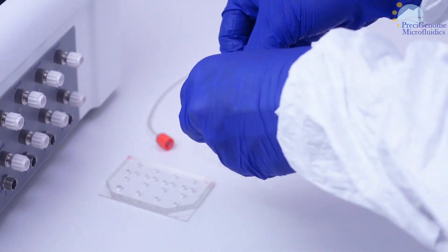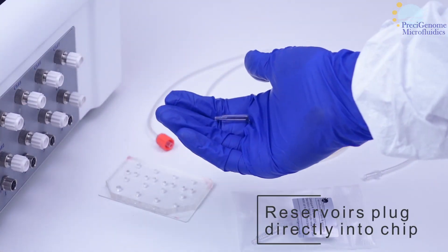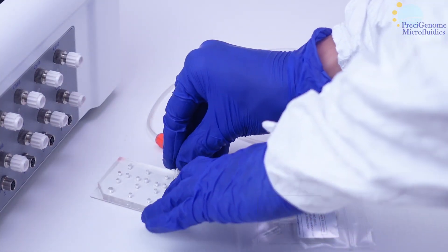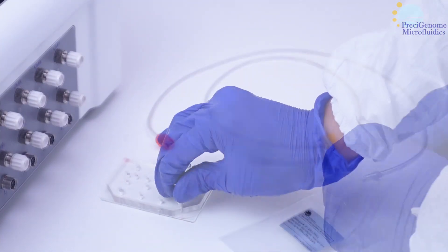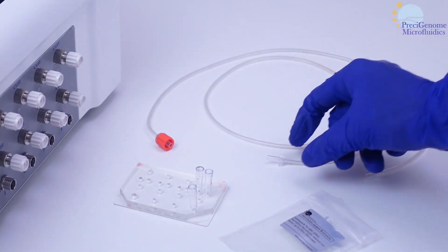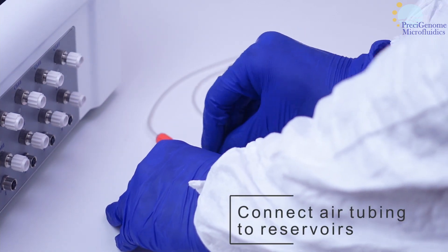These reservoirs meanwhile plug directly into the chip. Connect all needed reservoirs. Note the markings on the PDMS chip for appropriate reagents. Next, connect the Tigon tubing to the appropriate reservoirs.